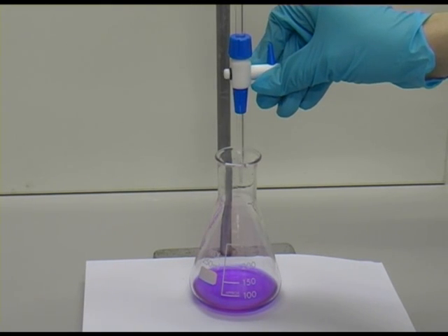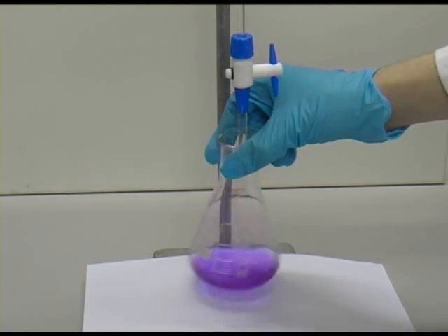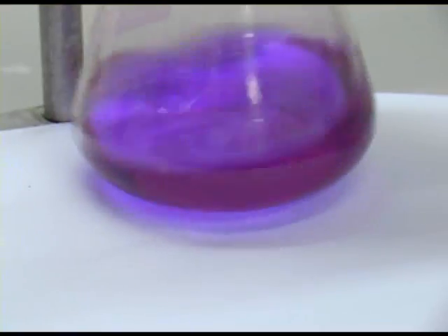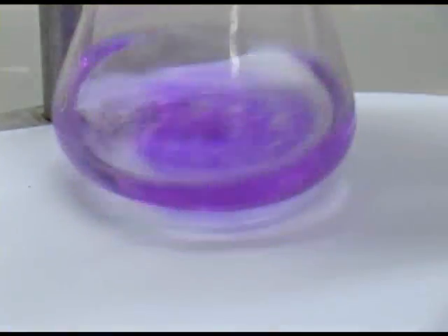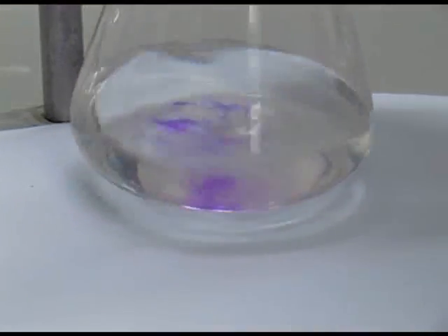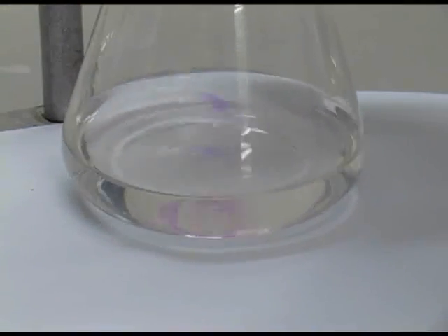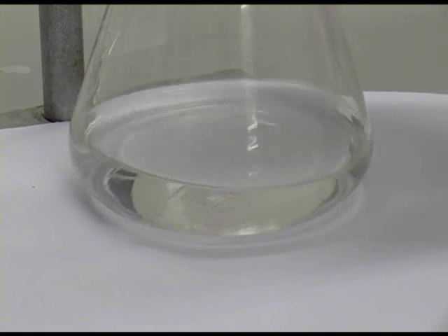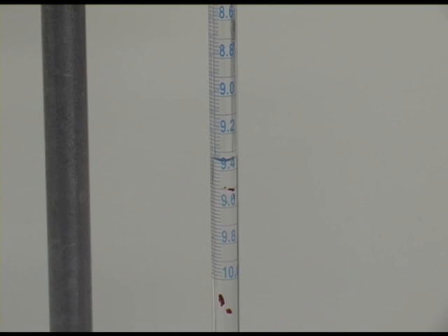The scientist opens the tap and begins to swirl the flask gently. Once the indicator has changed from coloured to clear, we know that all the alkali has been neutralised by the acid. The scientist quickly closes the tap on the burette and measures how much acid was added to the alkali.